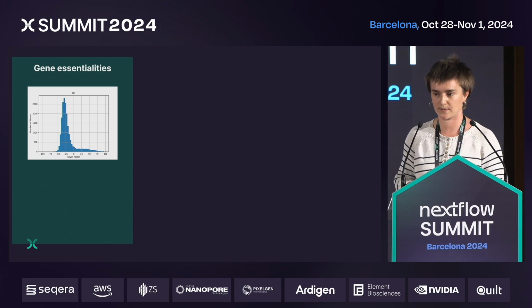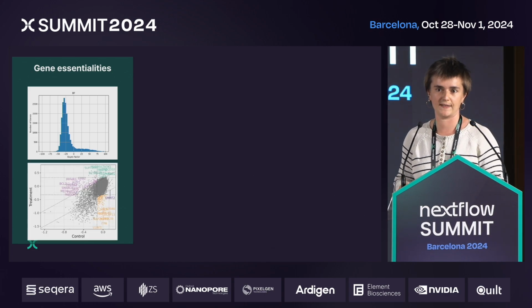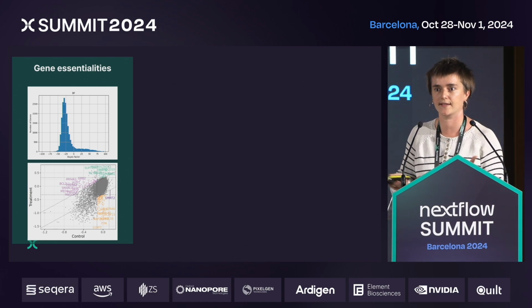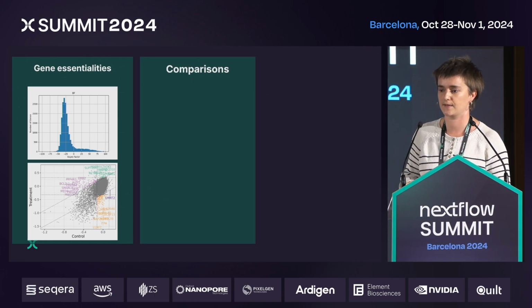So when you use CRISPRseq, you get these kind of plots that show you which genes have been noticed as being interesting. We call them essential genes, or we can also talk about synthetic lethality. And then you can really pick from these plots. We start from FASTQ files and already get results, biologically relevant results.